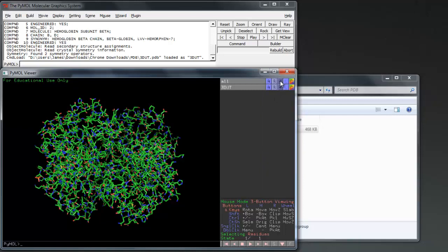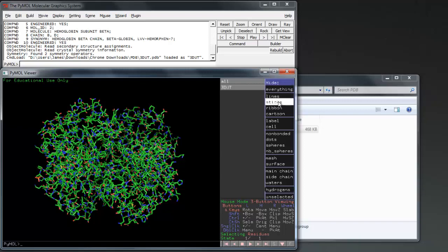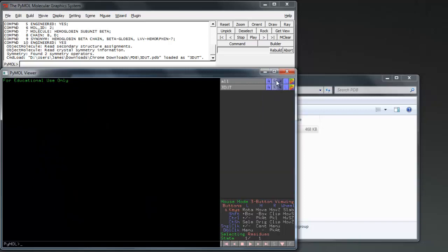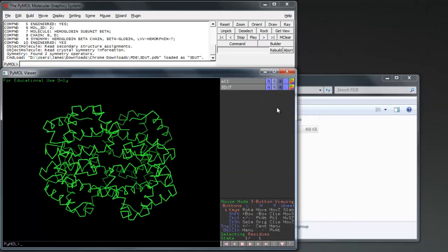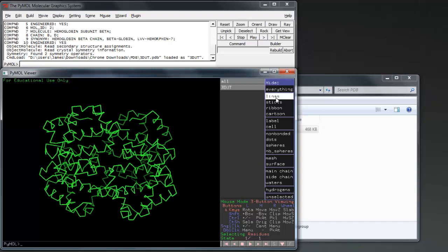The ribbon option shows the alpha-carbon trace, in other words connecting the first carbon atoms attached to each functional group. This option can be good when you want to show the internal structure of a protein but reduce noise.